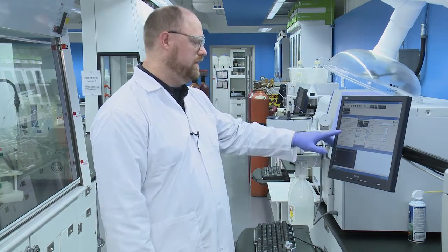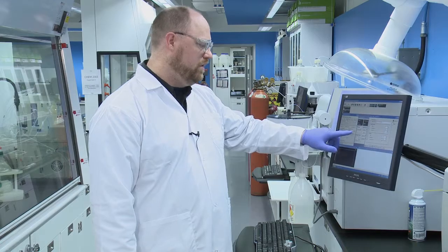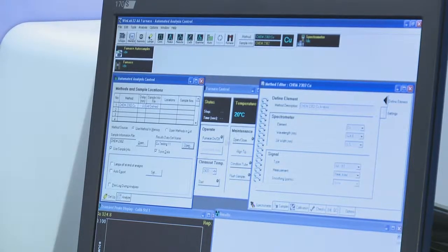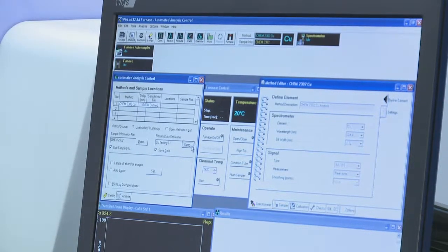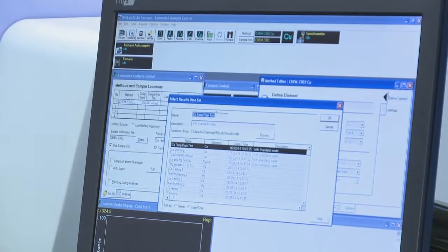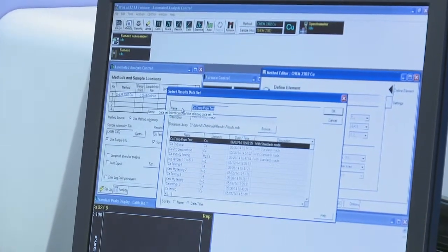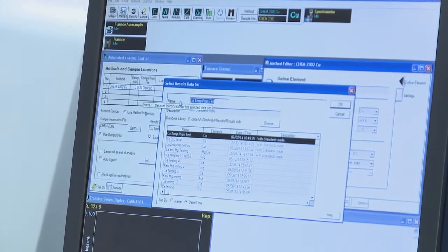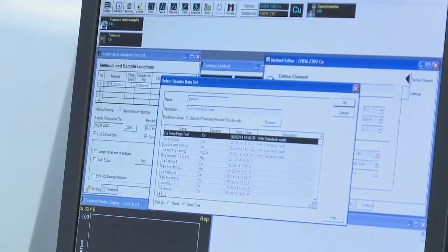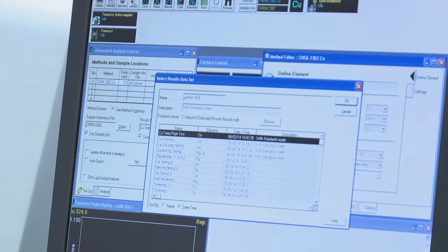So the first thing that you're going to do on the computer is you're going to want to open a dataset file. So you're going to click on open beside the dataset results name. Then you're going to type in something here that identifies you and what you're analyzing. So you can put in your name and your sample number. And then you click OK.